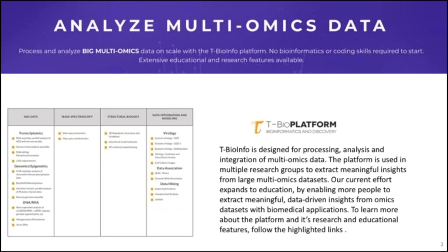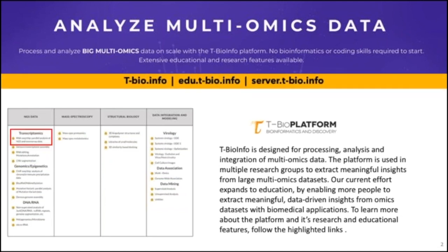Now in RNA-seq, there are a few ways to look at the differences between samples. We either can have a simple separation of just two groups, or we can have multiple types of groups and classes, and then we need to apply more advanced methods. In this session, we looked at RNA-seq processing.